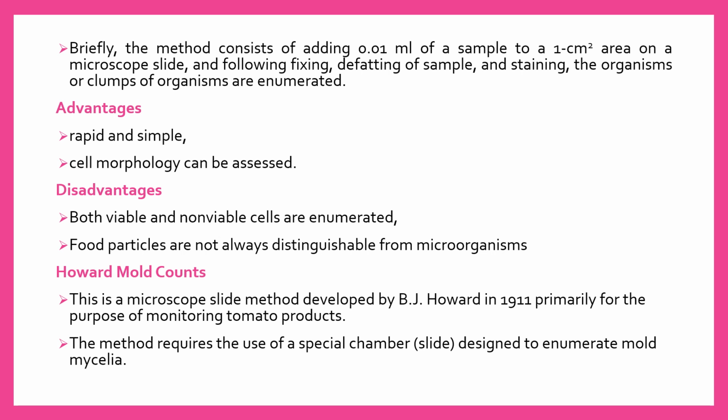Advantage of this method is it's rapid and simple, and the cell morphology can be assessed easily. And the disadvantage of this method is both viable and non-viable cells are enumerated. Next one is food particles are not always distinguishable from microorganisms. So this is the main disadvantage.